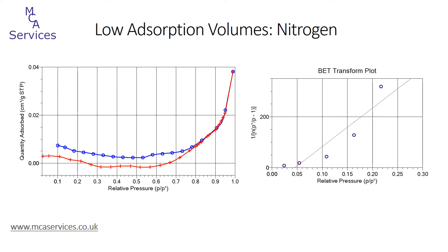We can still apply BET theory to the data, and when the BET transform plot is shown on the right, the transformed relative pressure data does not fit at all well to the regression line and we can see that the y-intercept is negative. Consequently, the BET C value is negative, which is theoretically impossible as it would mean a negative heat of adsorption. A BET area is still calculated at 0.003 square meters per gram, but given the poor fit, the poor correlation coefficient, the negative C value, and the general isotherm profile, we have to consider this to be erroneous and not a true representation of the sample surface area.